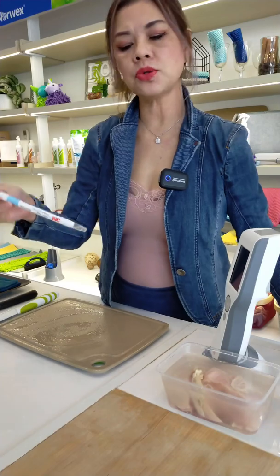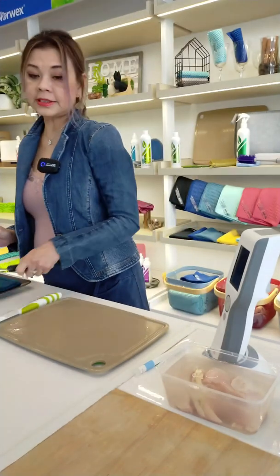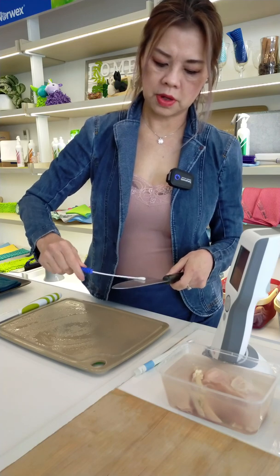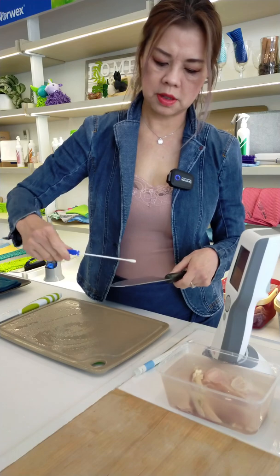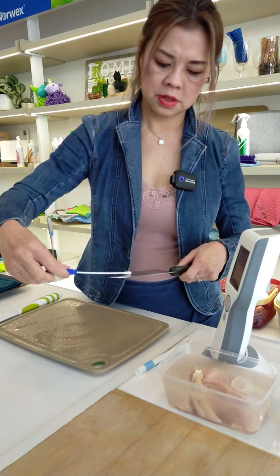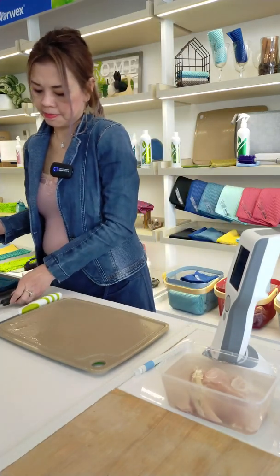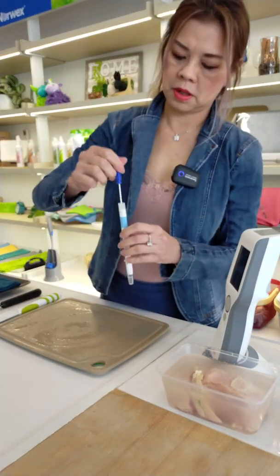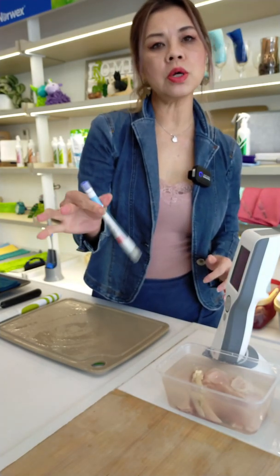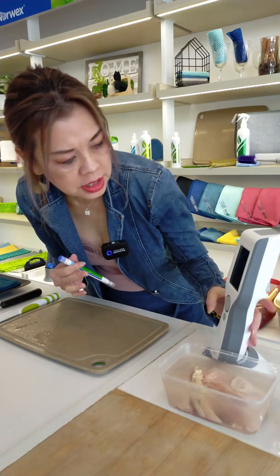I'm taking a swab and I'm going to swab the stainless steel knife first. I'll leave it for a count of 10: 1, 2, 3, 4, 5, 6, 7, 8, 9, 10. The machine went off again — new test.